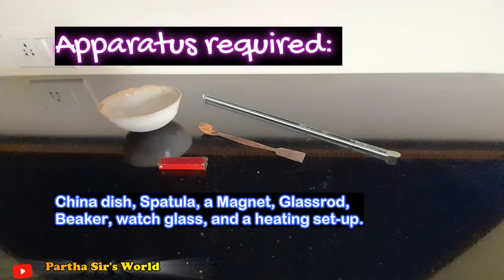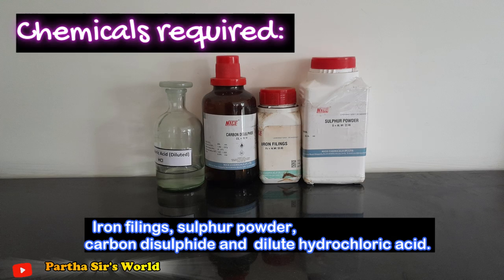Apparatus required: china dish, spatula, a magnet, glass rod, beaker, watch glass, and a heating setup. Chemicals required: iron filings, sulfur powder, carbon disulfide, and dilute hydrochloric acid.